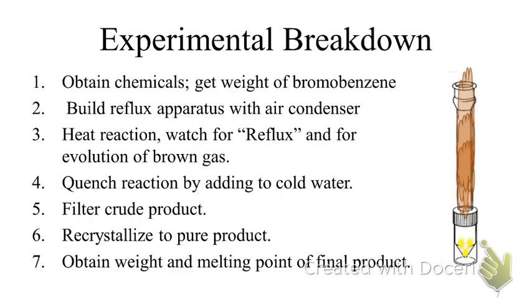When you set up the reaction and get it heated, a good sign that the reaction is working is that you'll see a brown gas evolved. That's what that brown sludge thing is supposed to be. That gas is due to nitrogen and oxygen radicals reacting with each other in the formation of the nitronium ion. Those gases are toxic, also known as smog. Please don't breathe that in. Set that to the back of your hood, let it do its thing, and hopefully get sucked up by the ventilation system so you don't have to worry about it.